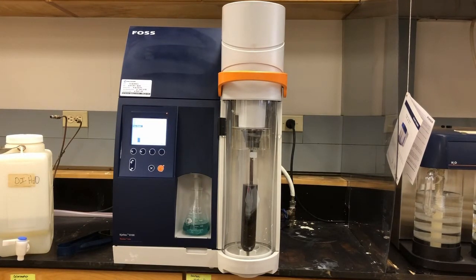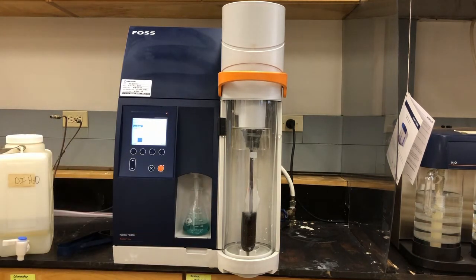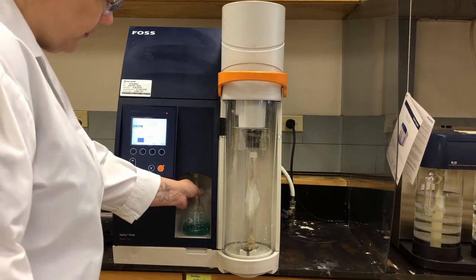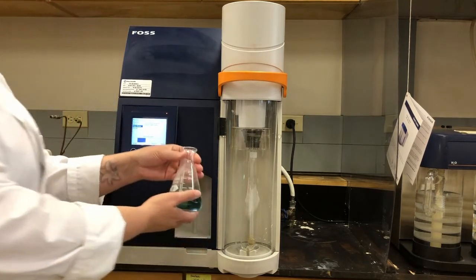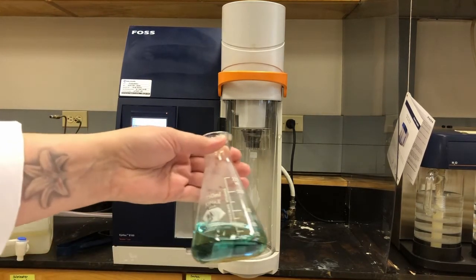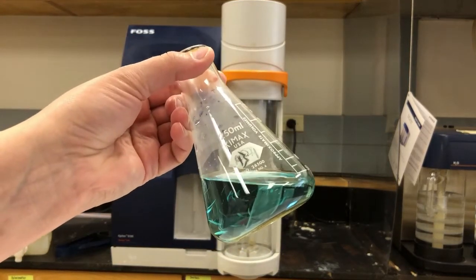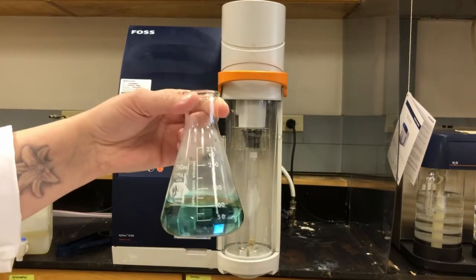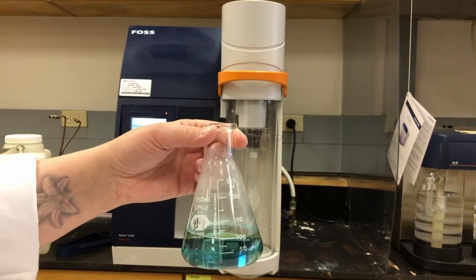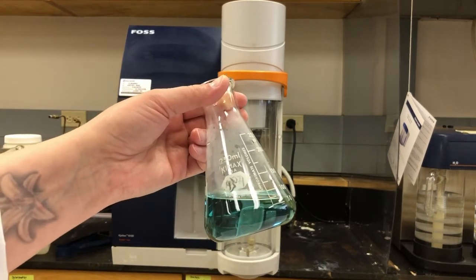Okay, so our distillation is complete, and you can see that this machine automatically drains our tube and dispenses that into waste. Our receiving flask you can take out, and you can see now that it has changed color. So it's a greenish color as opposed to the red we had when we started. So that means that our ammonia has been condensed into the receiving flask, and now we're going to perform a titration with this solution.